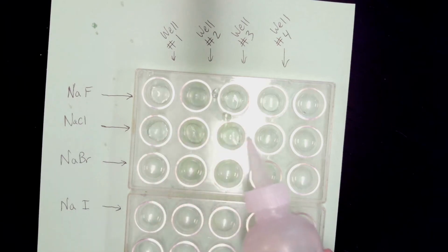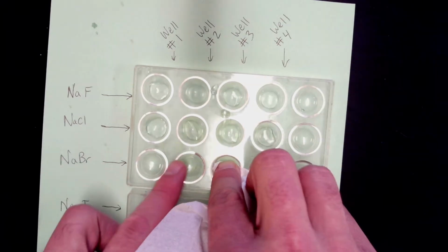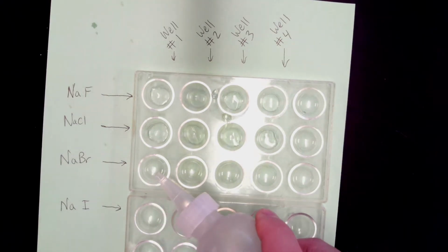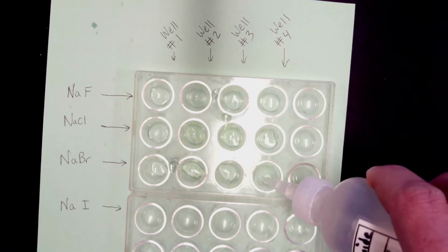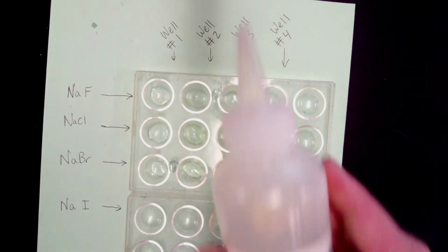And again, just to remind you here, fluorine is just fluorine by itself, but what we are working with here is sodium fluoride, NaF. So it's called fluoride when it's with a metal and it's gained the electron that it's looking for. The halides like to gain electrons. So each of the halides we're working with have already stolen an electron from sodium. So again, we got sodium iodide here.